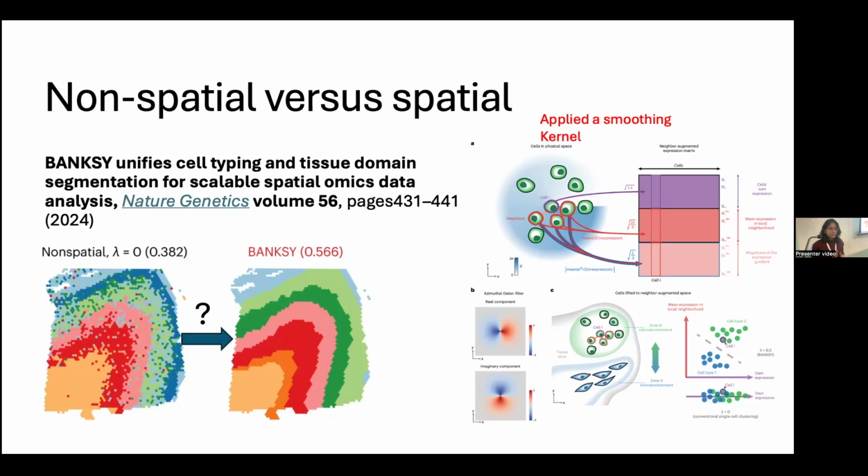But the thing is, I find that most of these algorithms work in the same way, so you don't have to spend too much time. Sometimes the logical way to do things is to really understand. I like it when authors explain their materials and methods in a very approachable way, in a very logical manner.